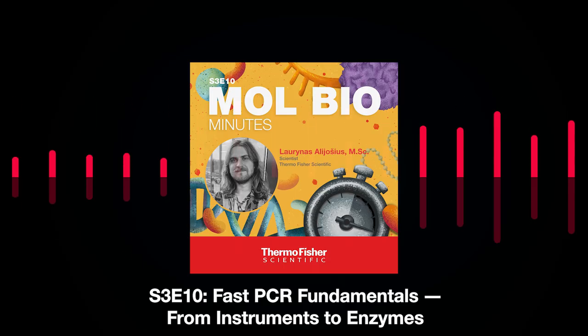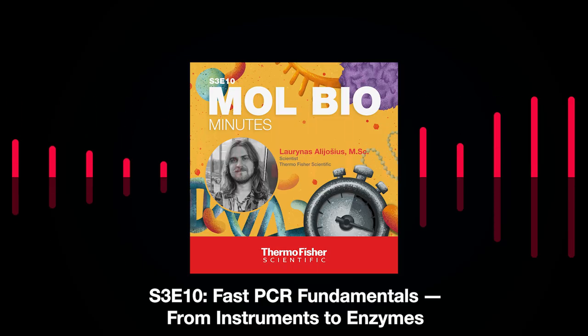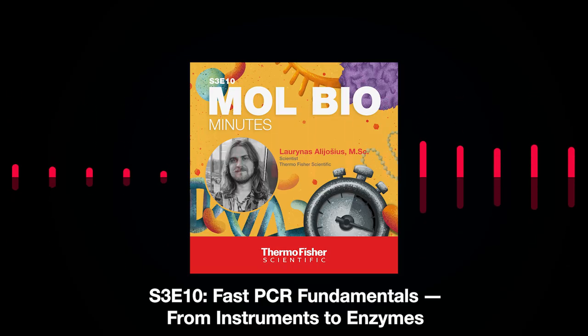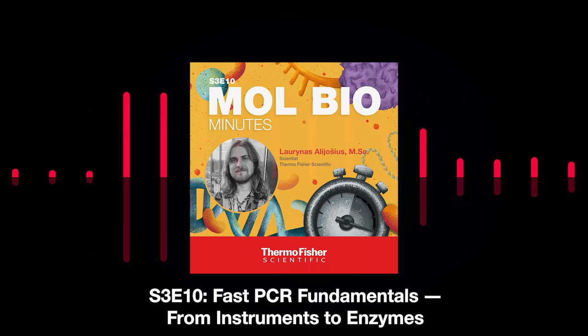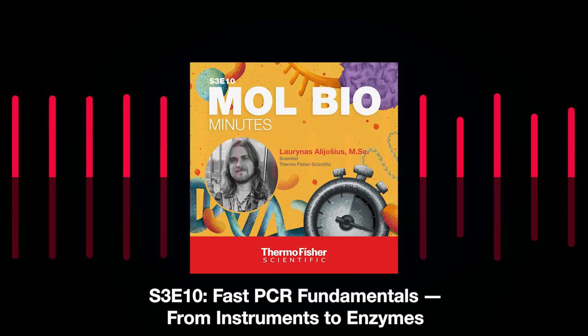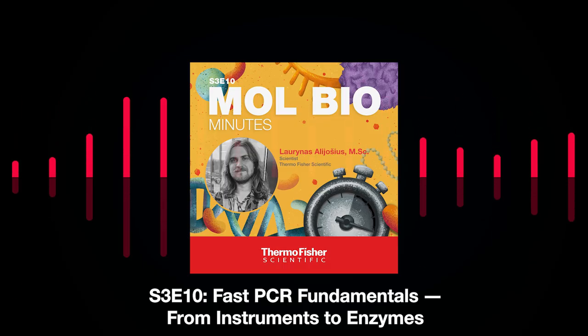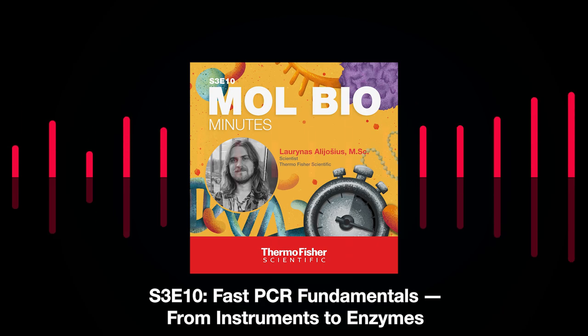The other important aspect is the length of your oligonucleotide primers. So these oligos are like short DNA fragments that help you target your region of interest in your DNA template sequence. Typically, primers are usually designed to be from 18 to 25 nucleotides in length.